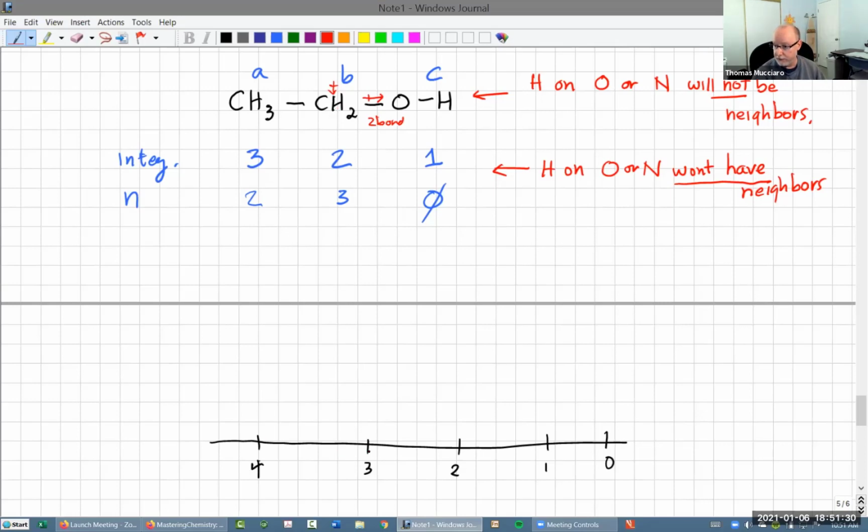That's what the table will tell us. And they have 3 neighbors. Three neighbors is 4 peaks. So they're going to look like this. The peaks actually have a specific shape, and they would probably come about 3.8, and it would be 4 peaks. This is hydrogens B, okay?